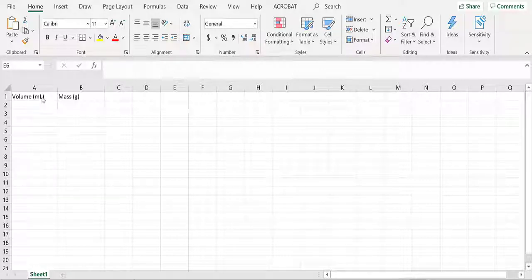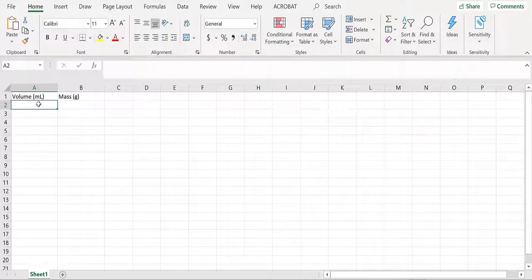So this is volume of water. That should be provided on your data table. You assume your initial volume of your burette is 0.00. So whatever the volume that's given to you in each trial, that's actually the volume of water that's being reported. Okay, so basically, let's say this data here, I'm just going to make something up. It won't be the same as your dry lab data, so please don't copy these numbers, but your numbers will be pretty similar, I assume.